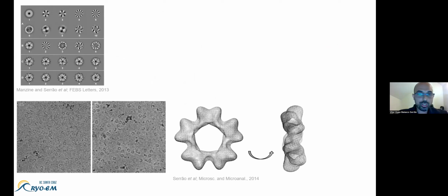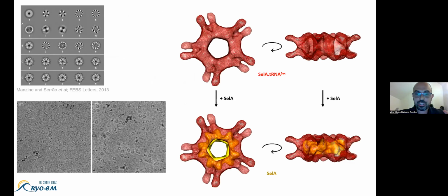That fits what we were expecting. And then after that, we start processing with the tRNA. We can count 10 tRNAs. Everything was great. But this is the sad plot twist of this talk. There was a Science paper, and our name wasn't on it.